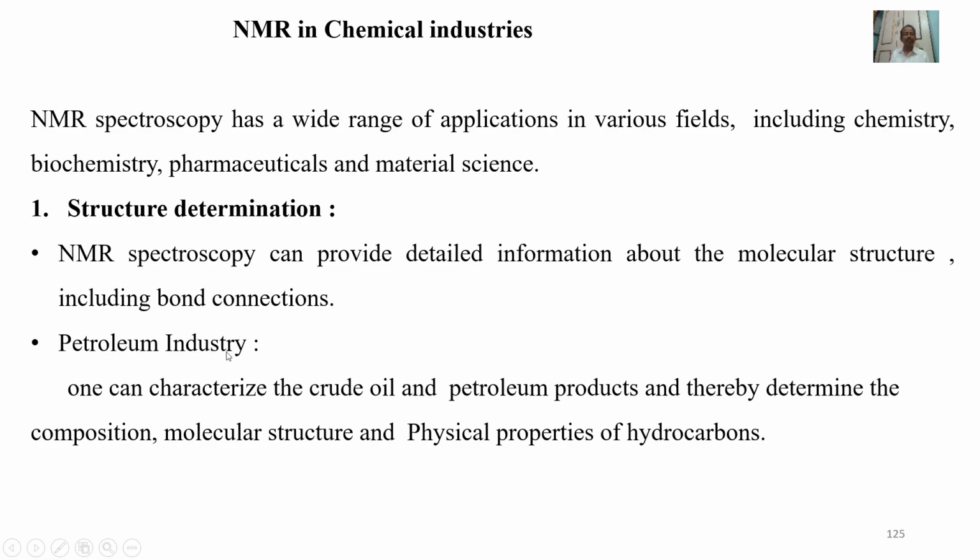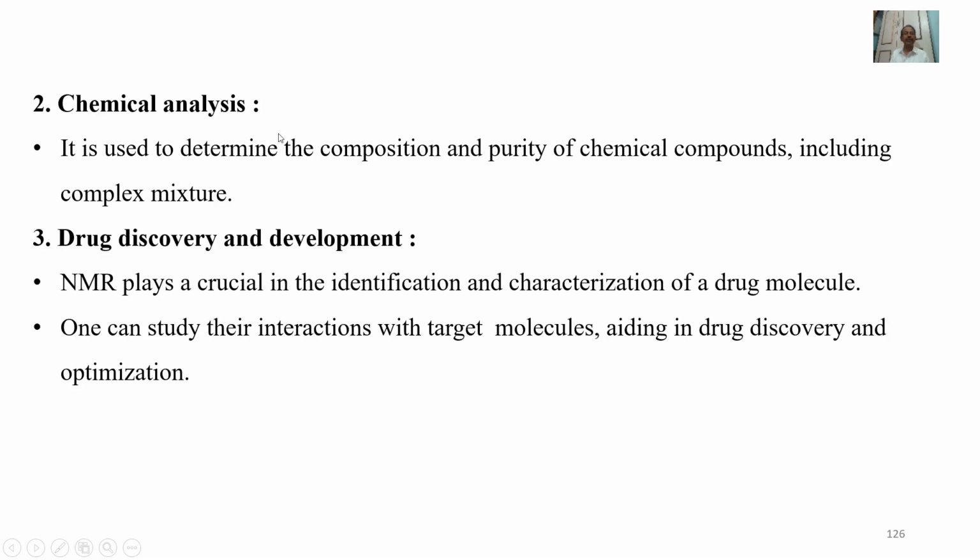Petroleum industry. One can characterize the crude oil and petroleum products and thereby determine the composition, molecular structure, and physical properties of hydrocarbons. Chemical analysis. It is used to determine the composition and purity of chemical compounds, including complex mixtures, drug discovery and development.